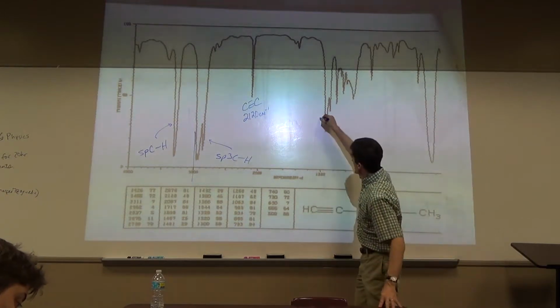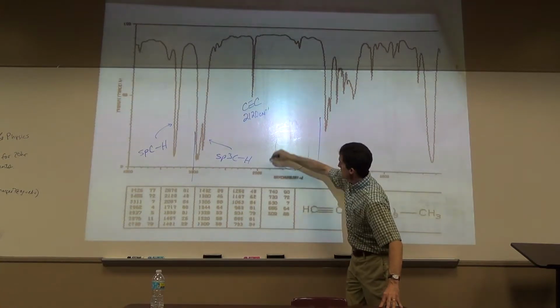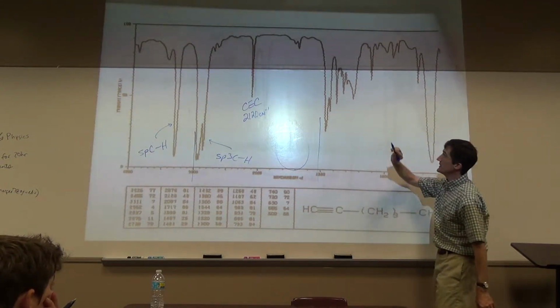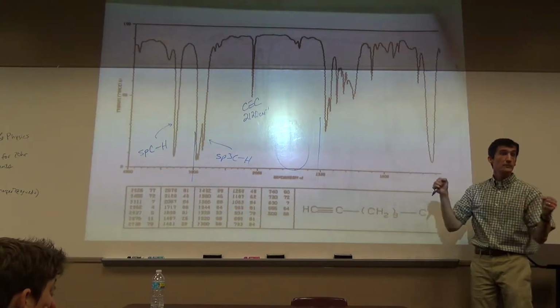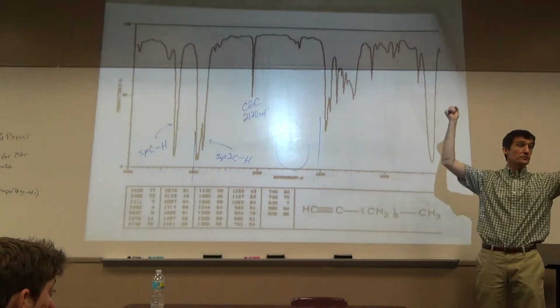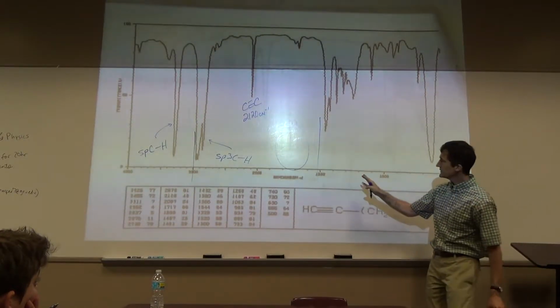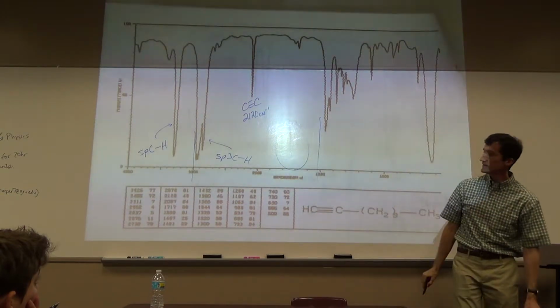Fingerprint. We have a little blurb right there. That's kind of carbonyl region, okay? It's carbonyl region. We certainly don't have a carbonyl. Also, carbonyls are typically intense. Probably nothing. It may be overtone. I mean, that's a huge peak. Usually huge peaks mean this really absorbs light. That's why it's so intense. If it really absorbs light, there's a good chance it may do a double jump. If it does a double jump, it will be double. So what's that? 6, 7, 8, 9. 6 something, the double peak would be 12 something. See, we're not even over there yet. Oh, that's all I can assign.